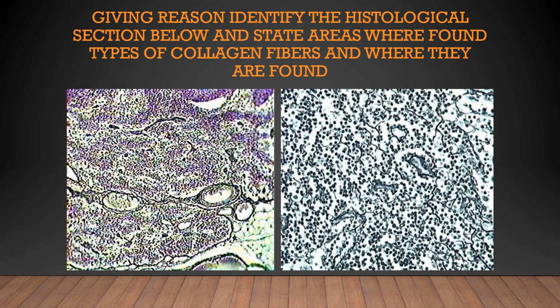Both these slides are of reticular connective tissue. That's because they contain reticular fibers, which are darkly staining. Reticular connective tissue is found in the liver, bone marrow, and other lymphoid organs.